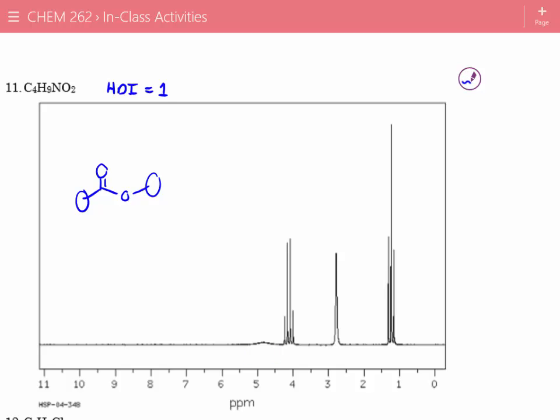Peaks that do this are occasionally alcohols, or things like amides, phenols, things like that. In this case, it's showing up around 4 to 5. That's where alcohols, amines, and amides show up. Phenols don't typically show up in that region. So let me move this over. And this is one you may want to try guessing and checking on quite a bit.